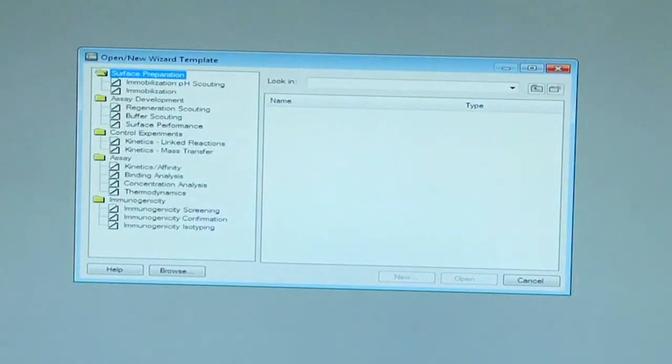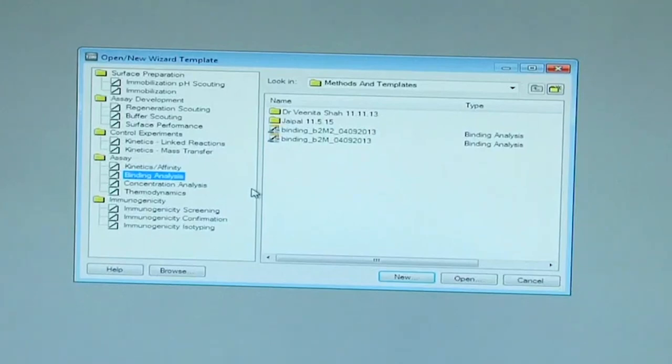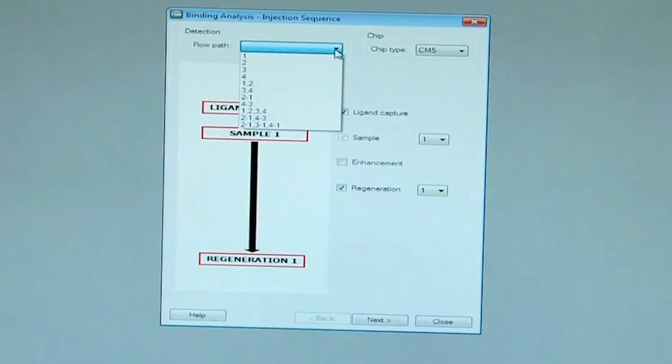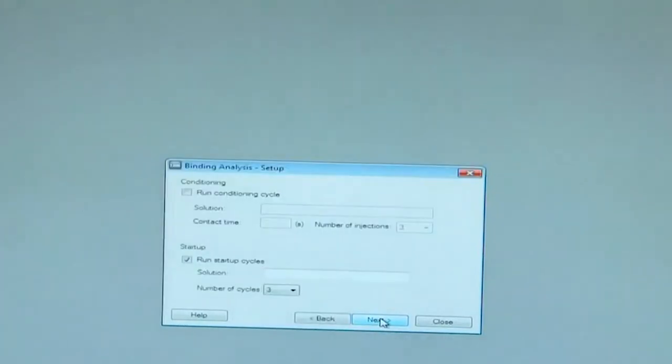File. Before making the template, we will open the file wizard again. Binding analysis. New. Identify the flow path as 2 minus 1 as we have done our immobilization on 2 minus 1. The chip will be CM5 that is docked already. We will not have ligand capture. Sample and regeneration. We will go to the next tab. Here, we are not using any conditioning cycle. We will start with the startup cycle.